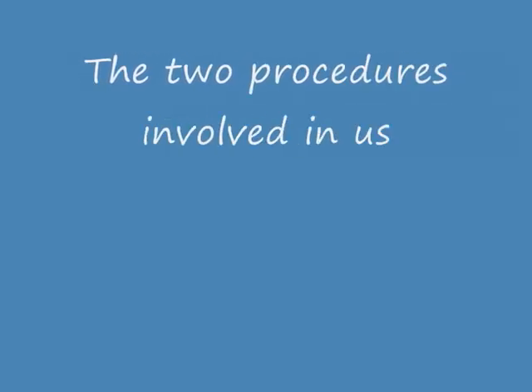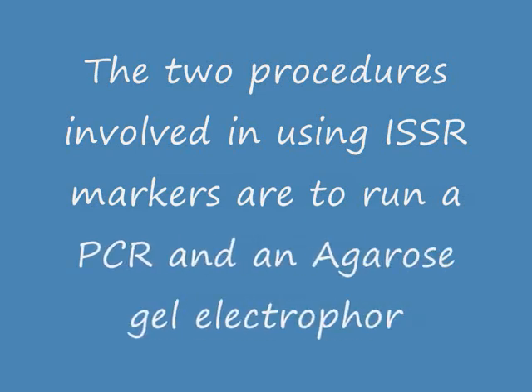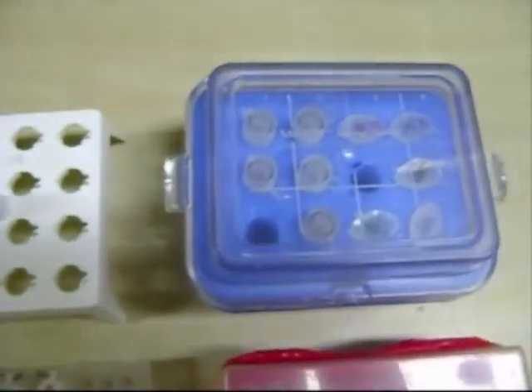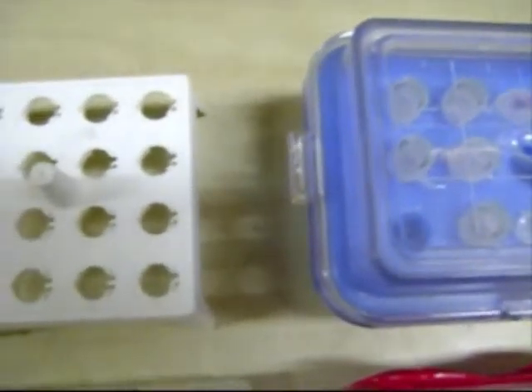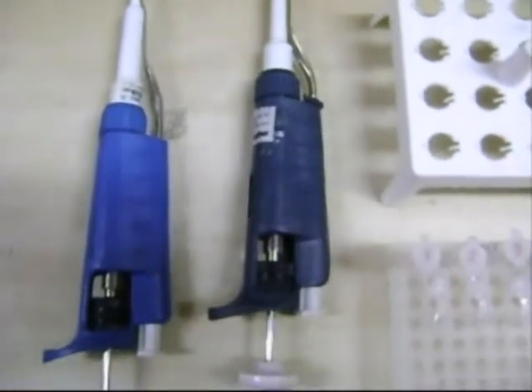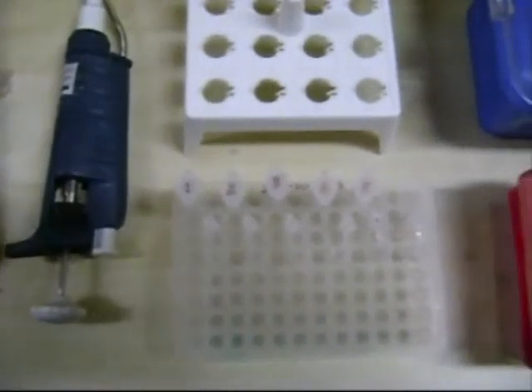The two procedures involved in using ISSR markers are running a PCR and an agarose gel electrophoresis. The components needed for the PCR cocktail are prepared and collected. The various components needed are an icebox with TAC buffer, Taq DNA polymerase, dNTPs, and primers. 20 and 2 microliter micropipettes are collected, and the genomic DNA samples are checked for concentration and prepared accordingly.